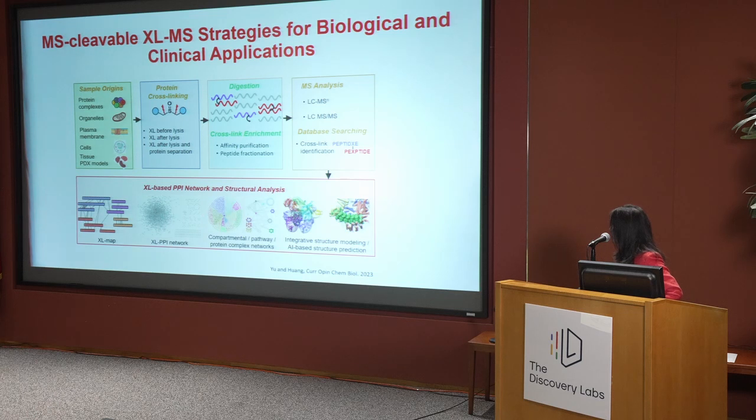Recently, we started to couple this information with AlphaFold prediction, hoping to generate structural models and integrate with integrative structural modeling, moving towards system-wide analysis.